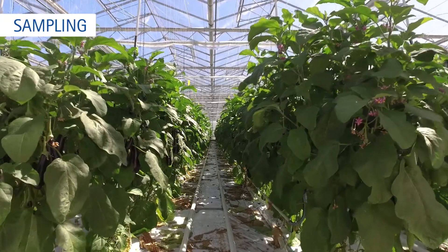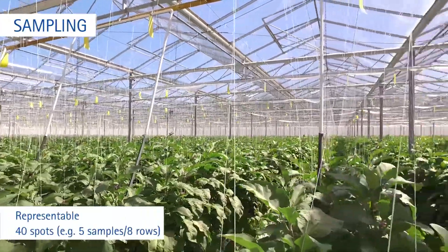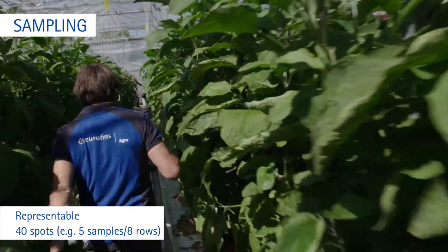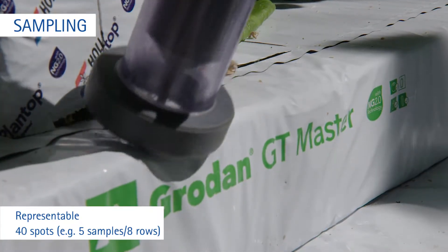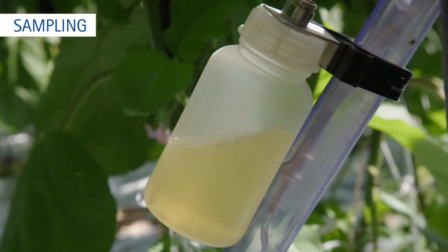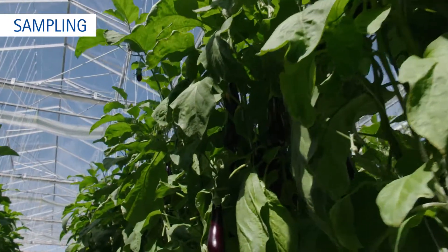Do not take a sample where the water is not refreshed while irrigating. Make sure that the sample is representative for the whole greenhouse. Collect water from at least 40 spots — for example, take a sample in 8 rows, 5 samples per row. Do not take a sample from plants at the edges of the greenhouse, and do not take a sample where the crop differs from the general view, unless you want to investigate the origin of growing problems.